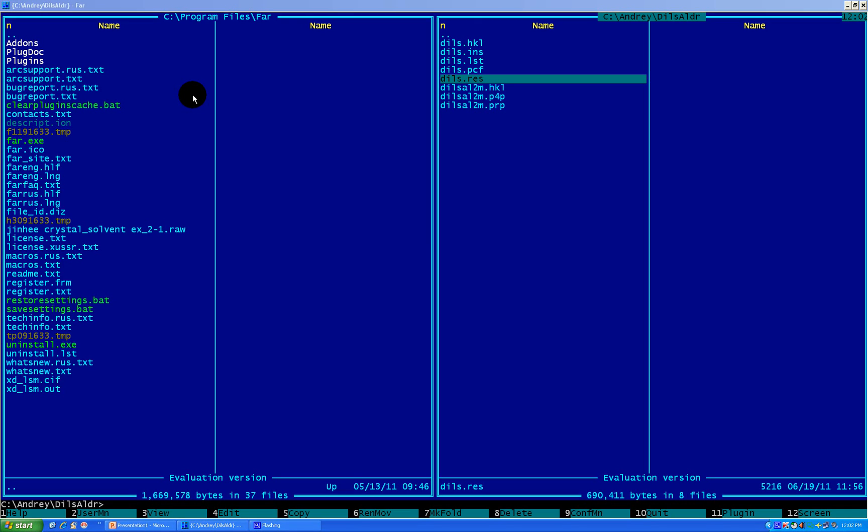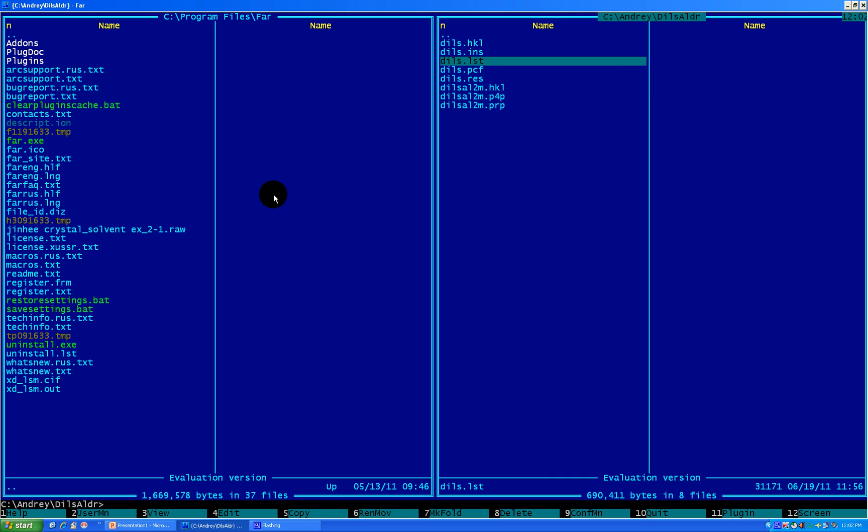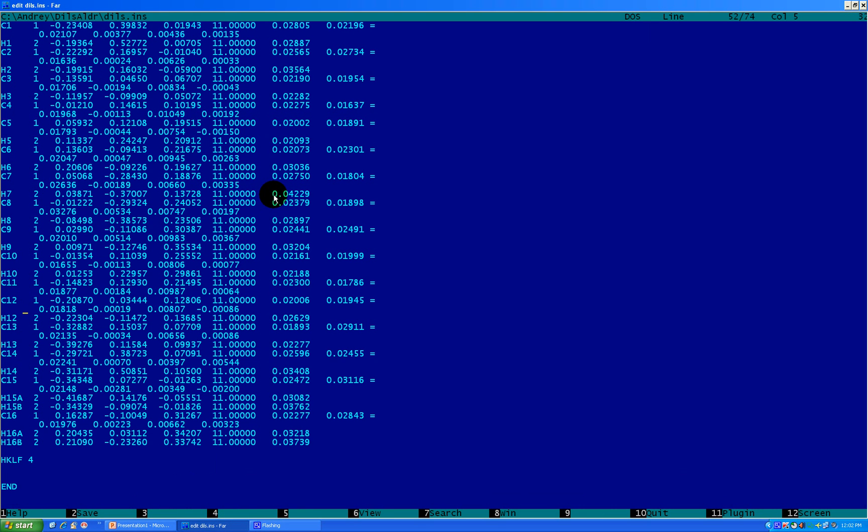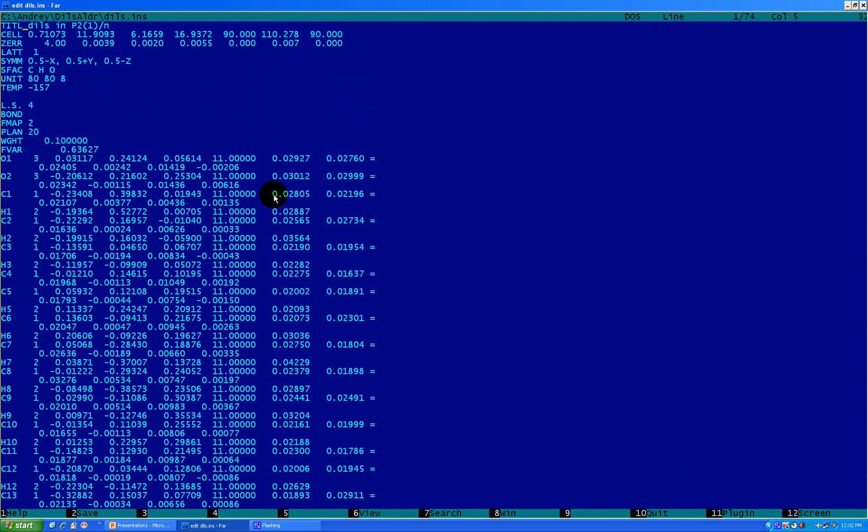Okay, the next step is preparation for publication and preparation of the CIF file. First thing we want to do is generate our CIF file. To do so, we need to go to the INS file, open it for editing with F4. Let's go to the top of the file and type here the command ACTA.